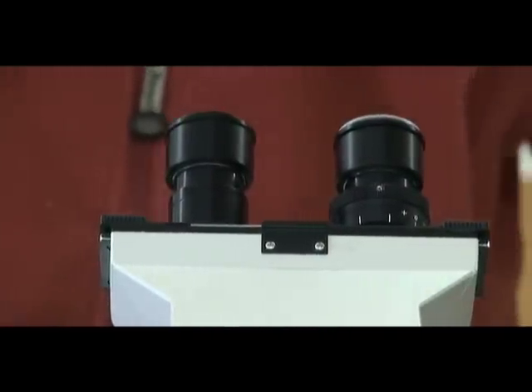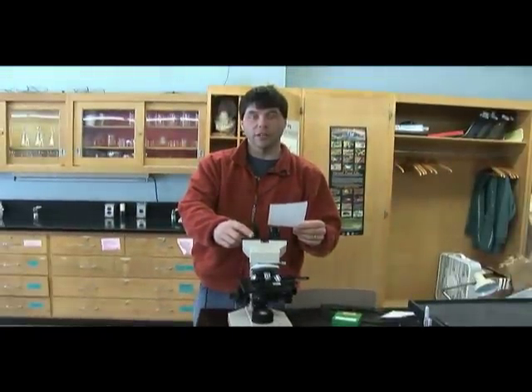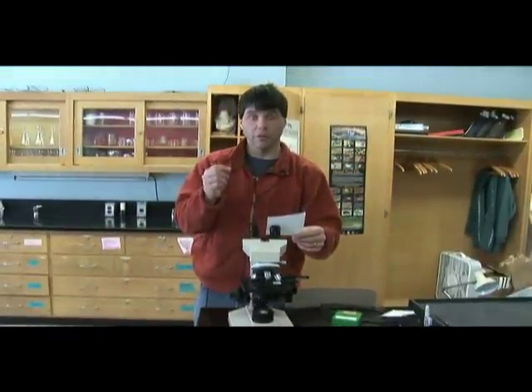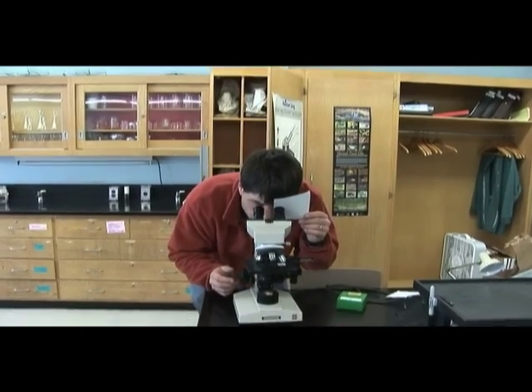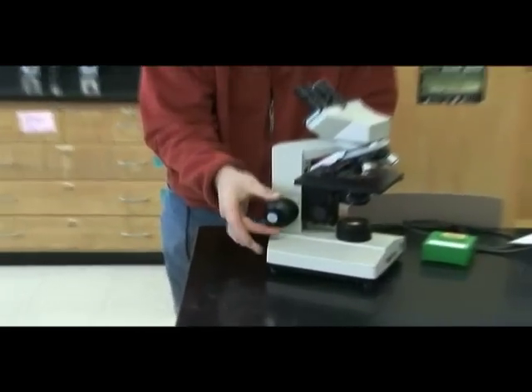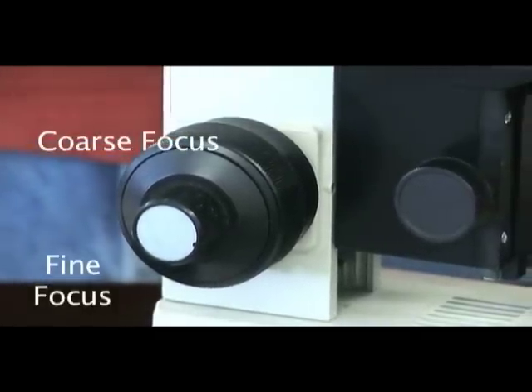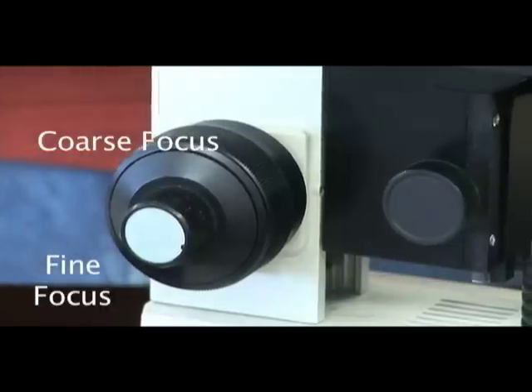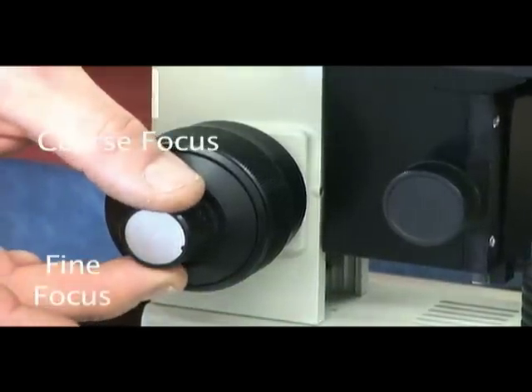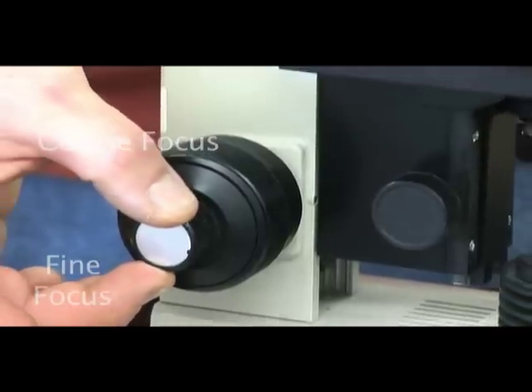So for me to focus on this particular object, and after the light is on, I'm going to use a piece of paper to cover my left eye, because the fixed ocular is the one I want to look through first and bring into focus. I can focus with the coarse focus knob when I am on the lowest power scanning objective lens, but if I move up to a higher power, from that point on I should always use the fine focus knob.